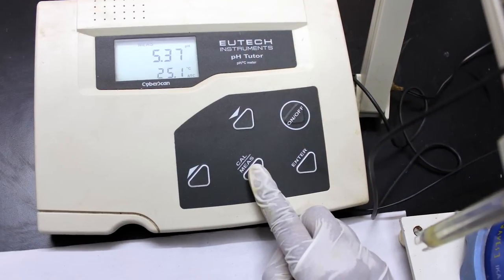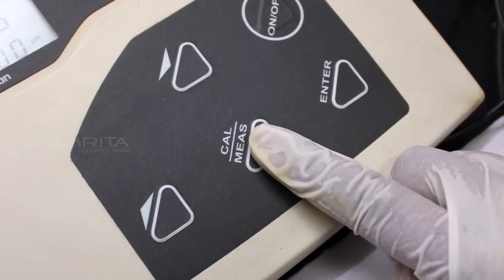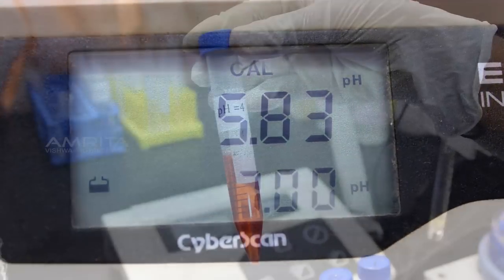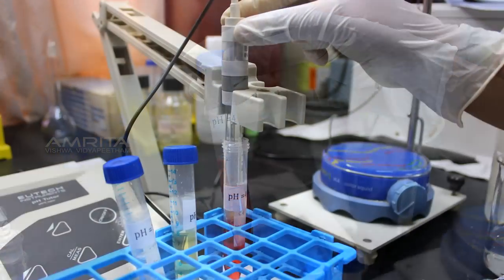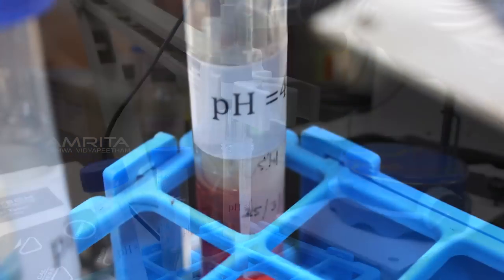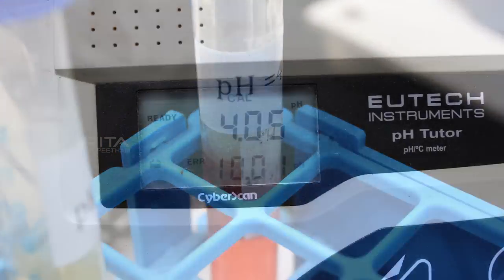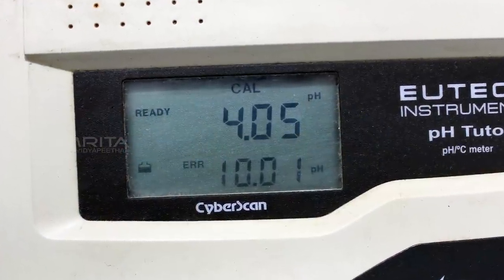Now calibrate pH meter by clicking on the button labeled Cal on the instrument and dip the pH electrode into the standard buffer labeled pH equals 4. Note down the value displayed on the pH meter which should be around 4.